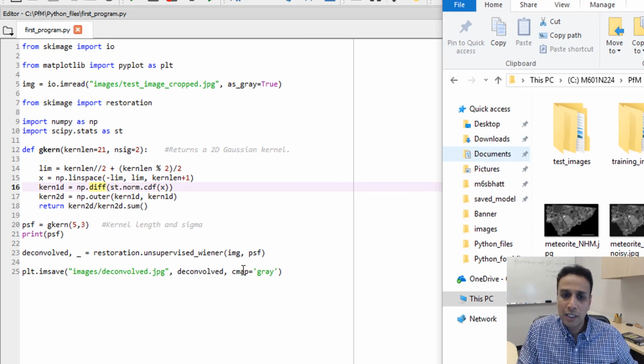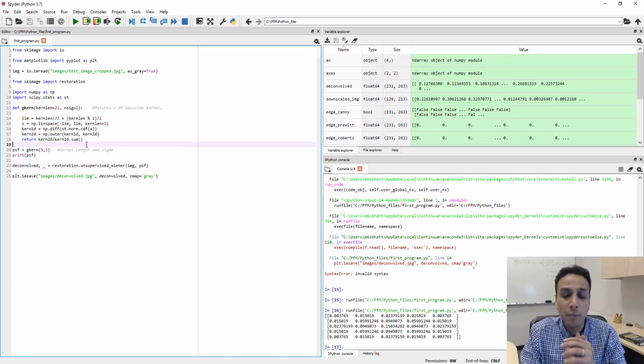Okay, so anyway, this is deconvolution. I'm not sure how useful this is going to be for you, especially if you plan on applying this on light microscope images. But if you can actually get this point spread function figured out for light microscopes, then you know how to do it now.